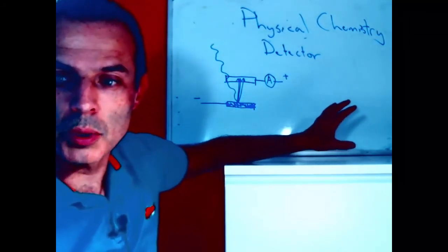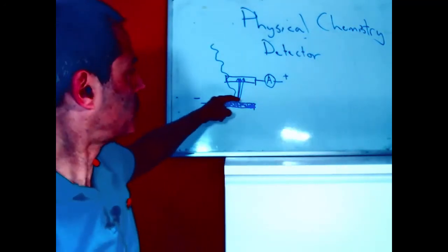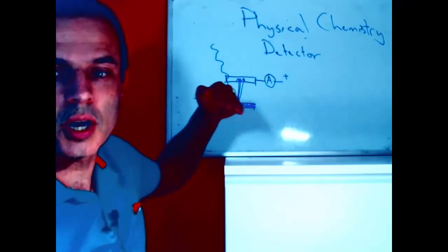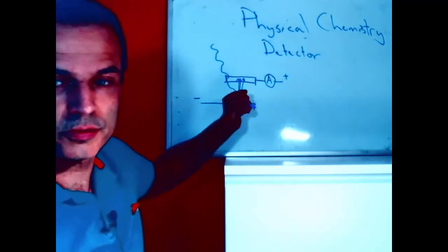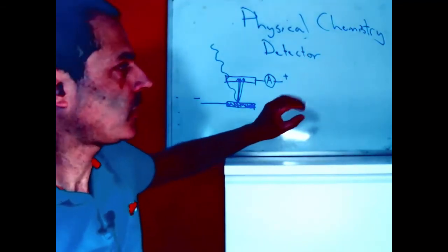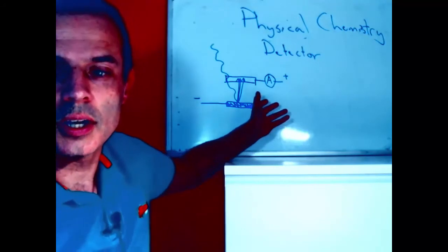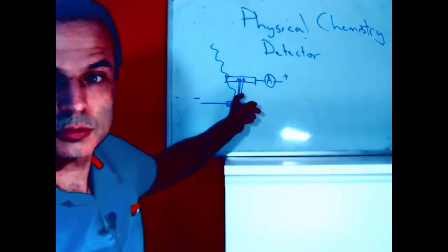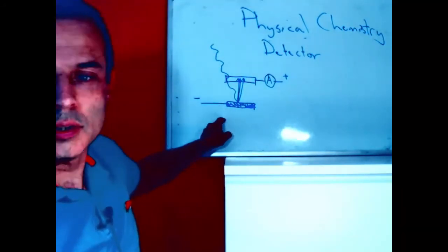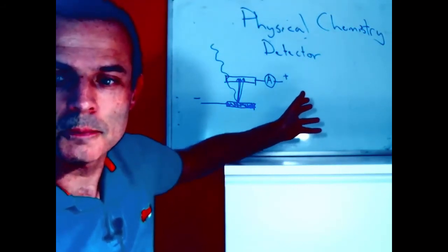Then the detectors don't matter as much because we have already split the wavelength up. So we can use the same type of detector, but we're only looking for number of photons because we know what the energy is at that position. That's obviously really handy. We could use any old detector. A camera detector will detect an X-ray. But what we can't do so easily is split up the energies. That's the bit that costs money.